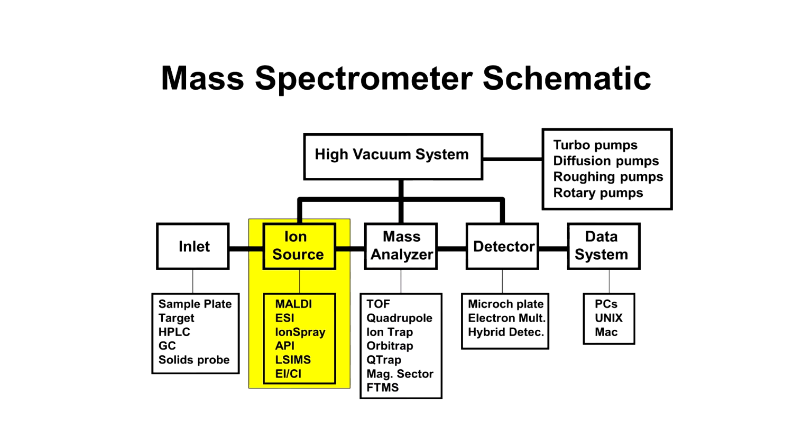So a mass spectrometer, as I say, has both an ionization source, an analyzer, and a detector. There's usually the separation, chromatography at the beginning, and then computers at the end, and always lots of vacuum pumps. And those are the things that usually break down. Mass spectrometry is an inherently dirty system, in that you're putting stuff in, burning it up. Eventually, after a while, the sources or the analyzer get dirty as well, and you have to clean them.